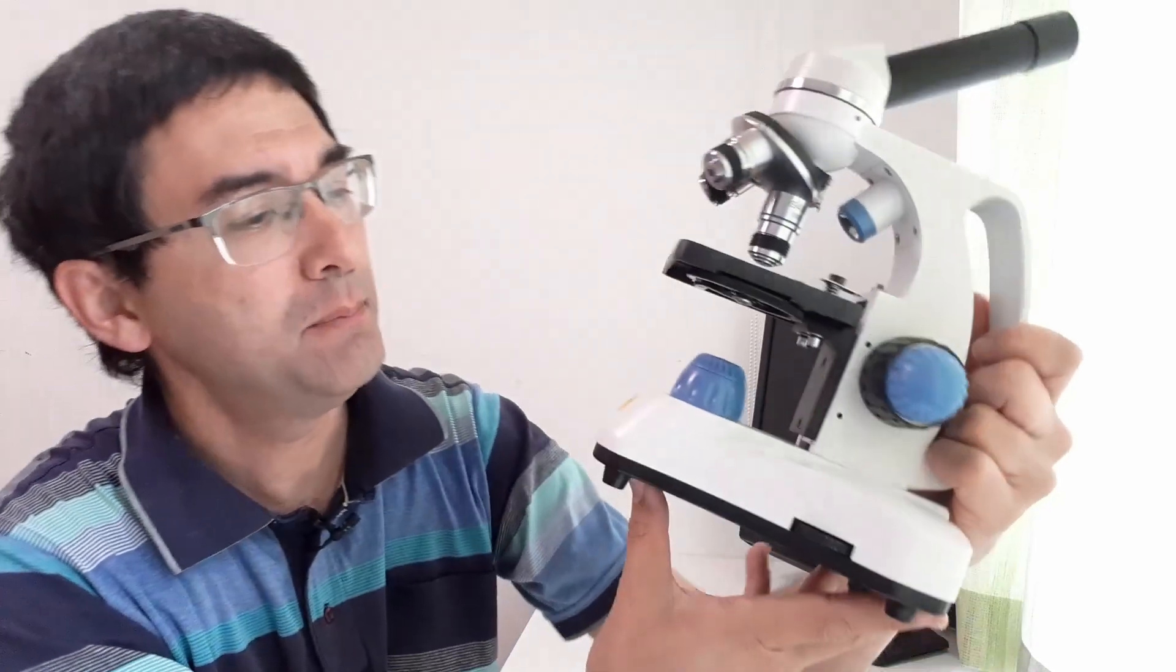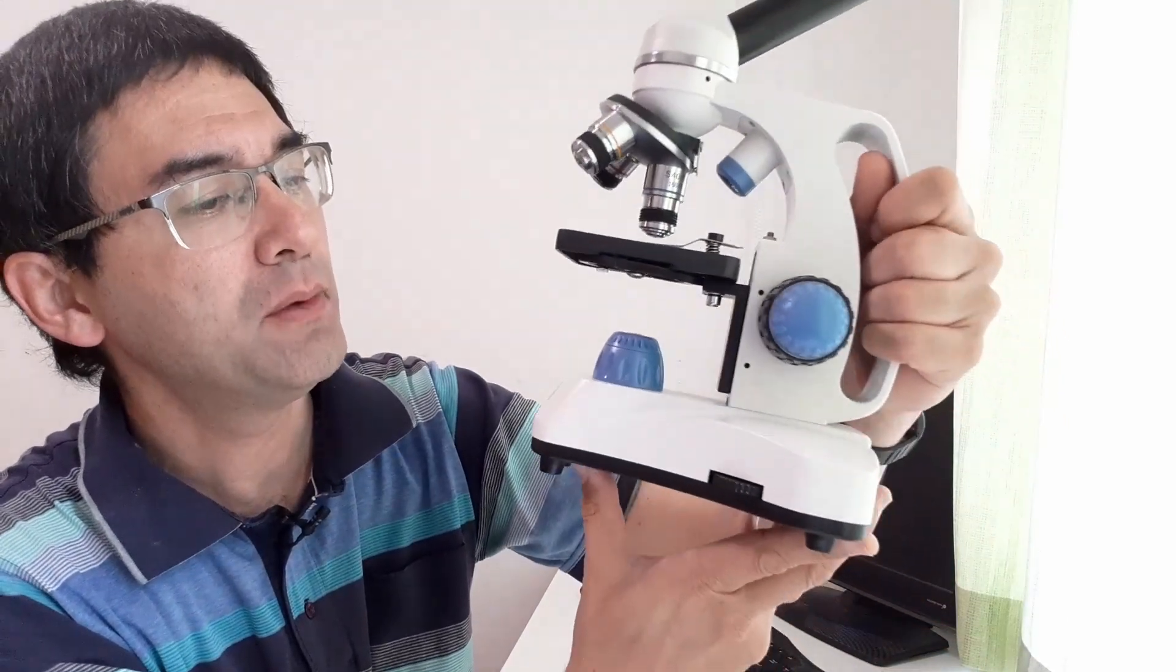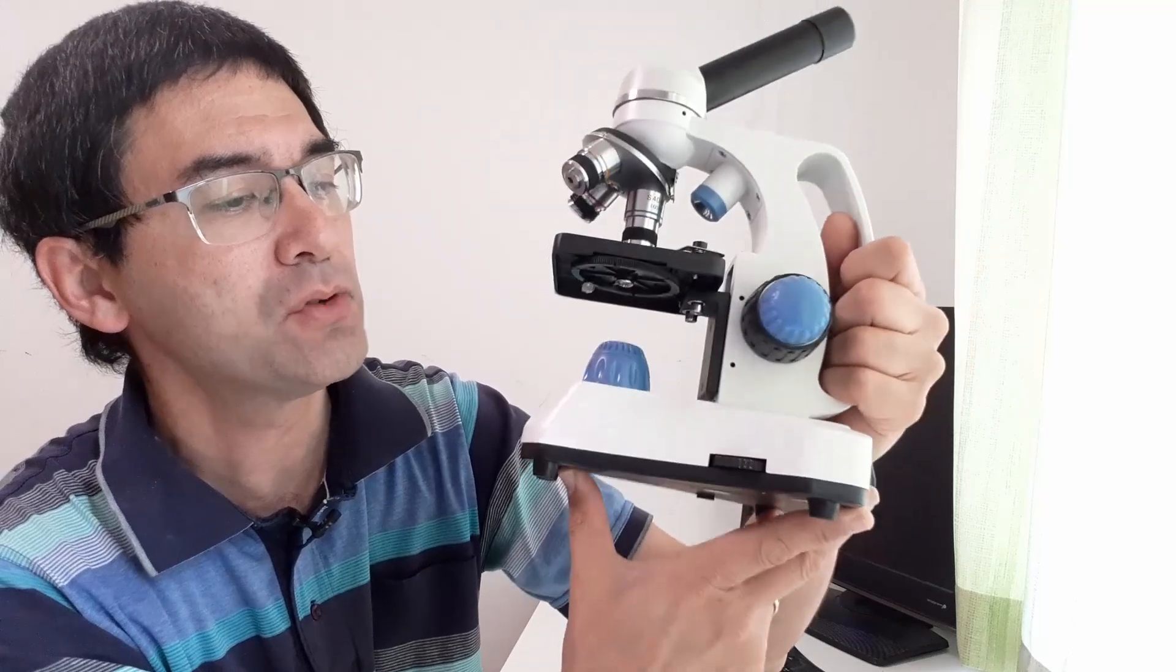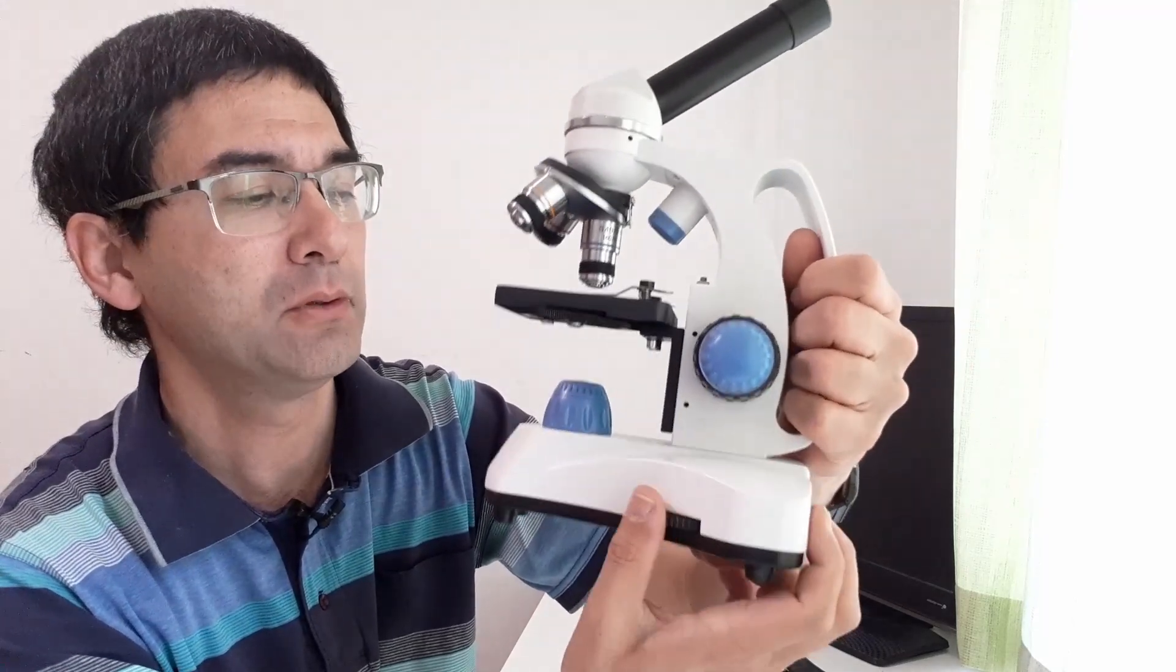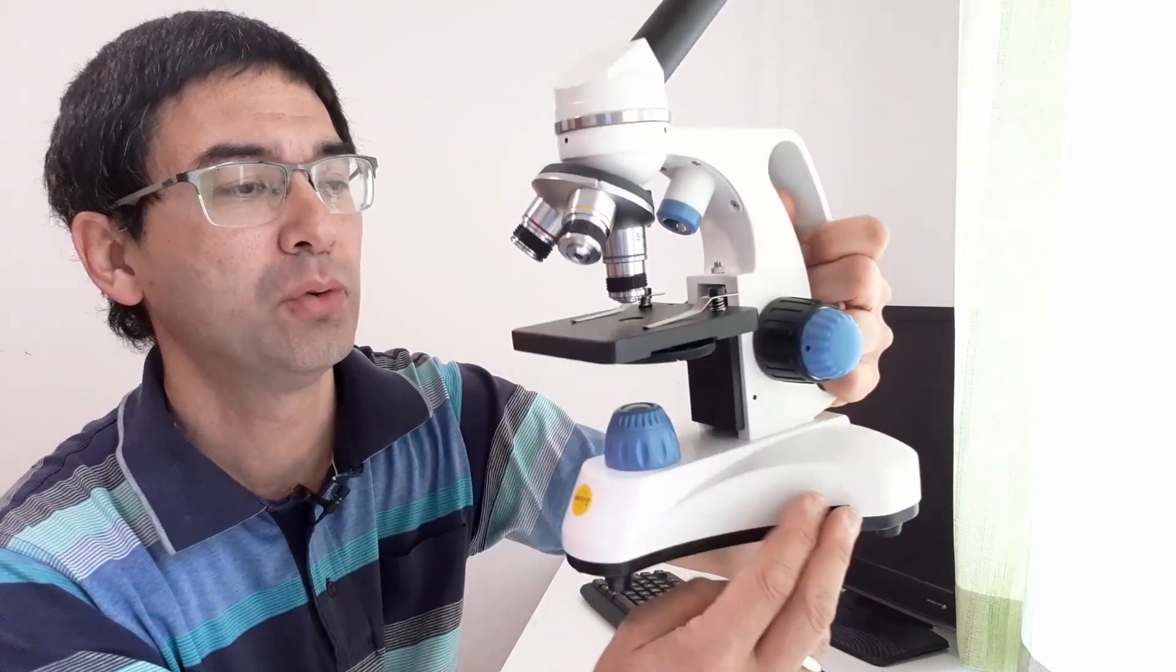So yeah, that is the quick overview. One of the things that I like about this microscope is the following.